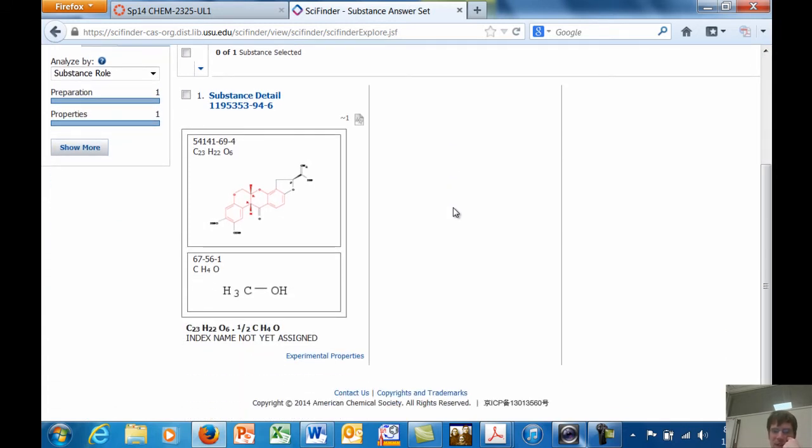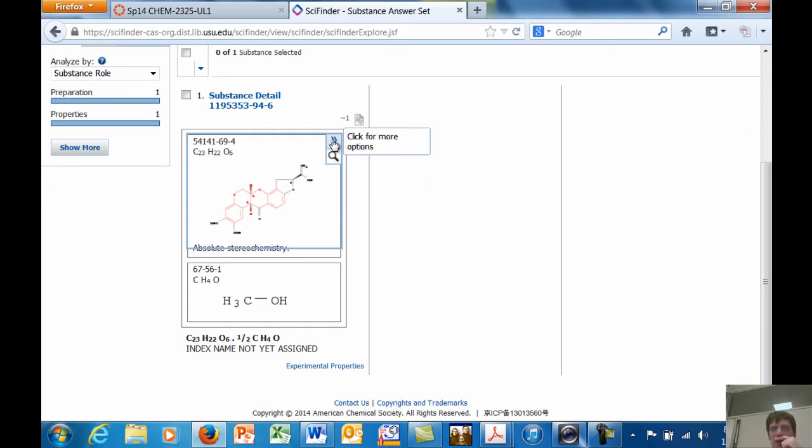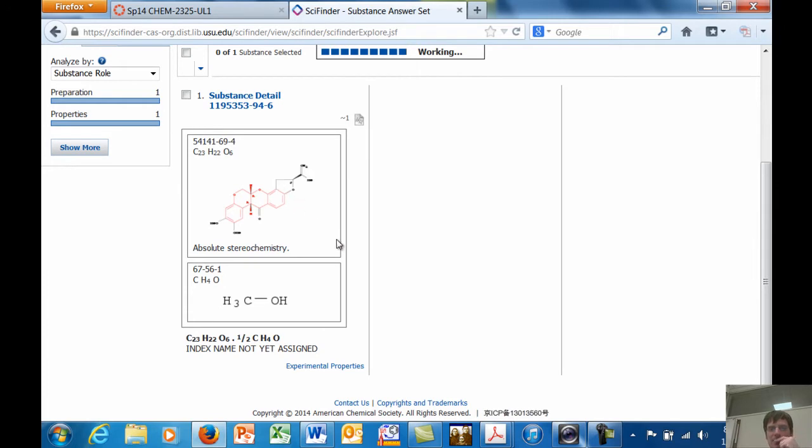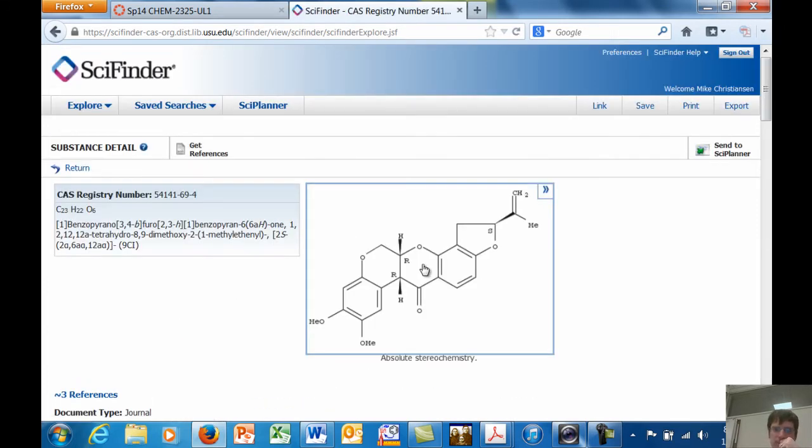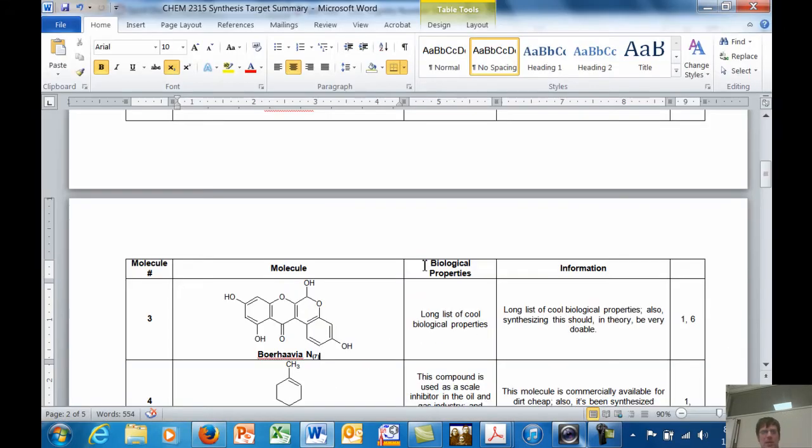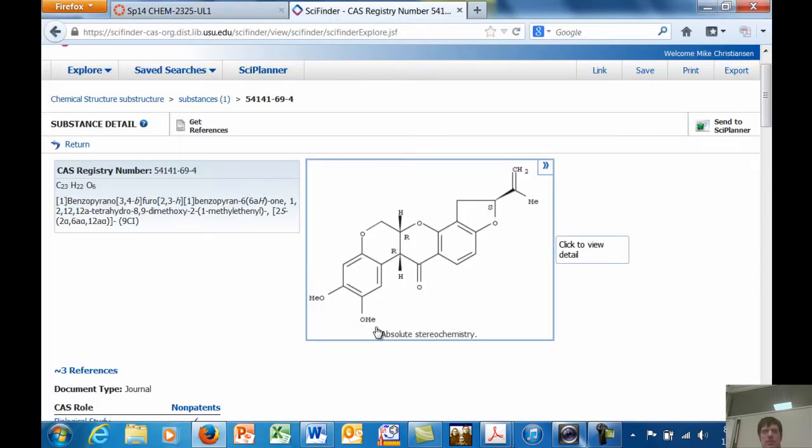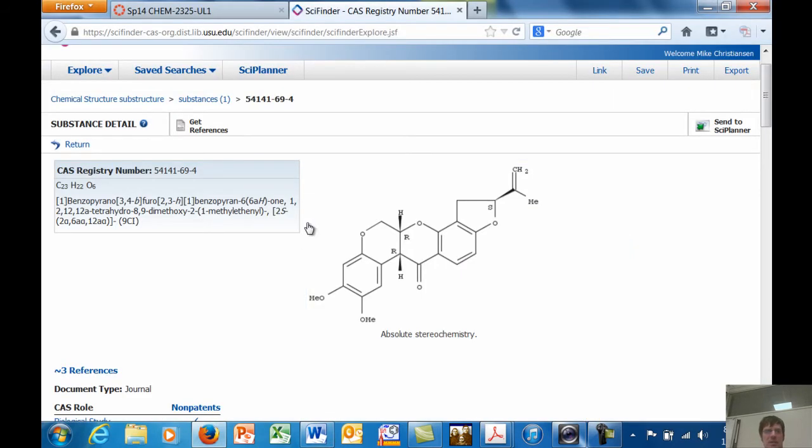And then I'll click substructure search. If I click exact search, then it will search for that exact molecule with no variations. But if I do substructure search, then it will find anything that looks like the molecule that I entered in. And there might be lots of hits. Wow, there's only one substance they found. And it's not the substance that we have reported here. So this is interesting.